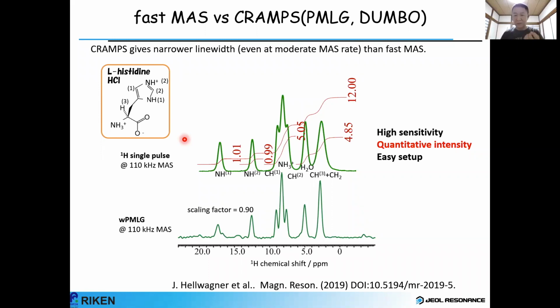But if your sample has anisotropic bulk magnetic susceptibility, in this case the resulting line shape is determined by the shape factor, which is described by a second order tensor, and the magnetic susceptibility tensor, which is also a second order tensor. That results in a fourth rank tensor. With that, we cannot get rid of it by magic angle spinning. In principle, we can remove this broadening by a DOR or that kind of experiment, but of course this is technically very demanding.